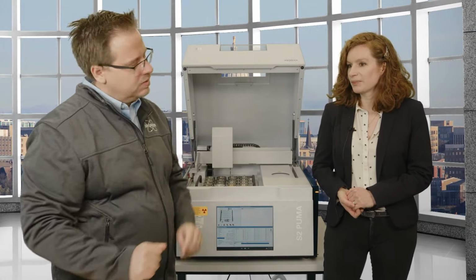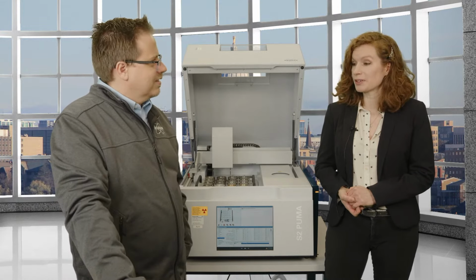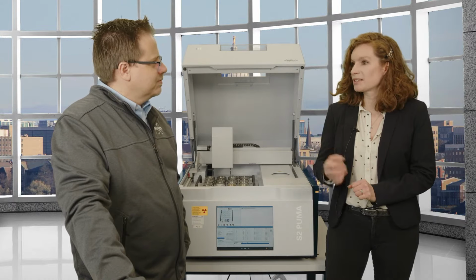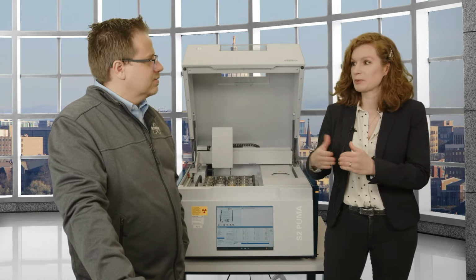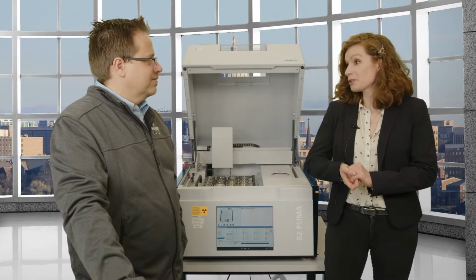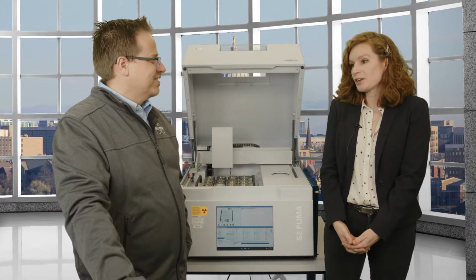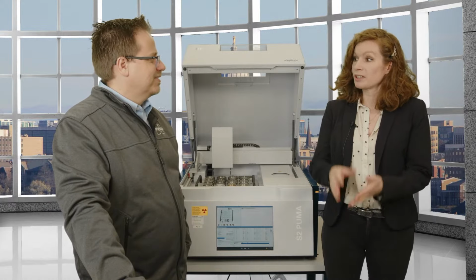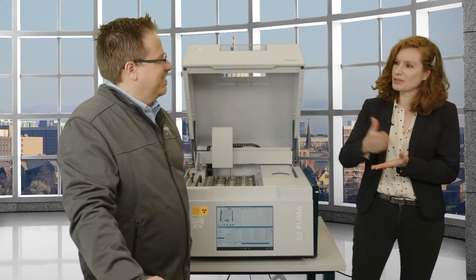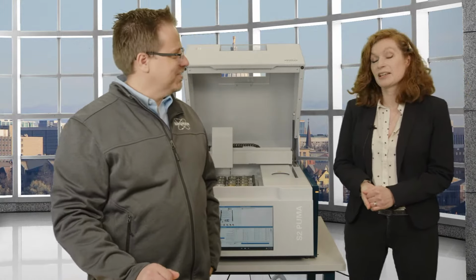Really? Wow. And staying in that same vein, I had a colleague who measured powder mixed with something and pre-made formula for babies because she wanted to know which one was better during the shortage around 2-3 years ago. Because she has access to a WDXRF system, she measured it and saw that the one she made with the powder, even according to the recipe, has more potassium and more calcium than the pre-made store-bought one. There we go. That's interesting. So you can double check everybody out there.